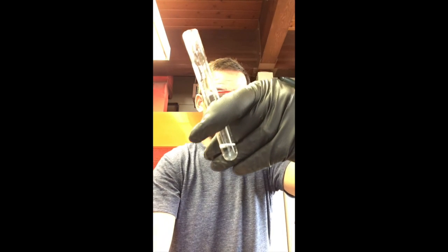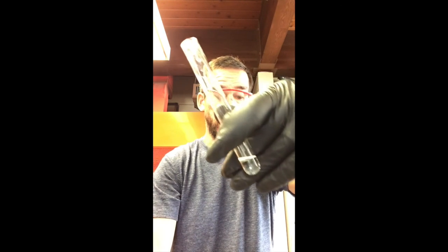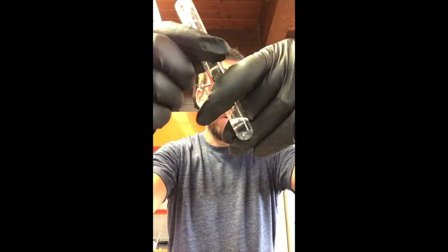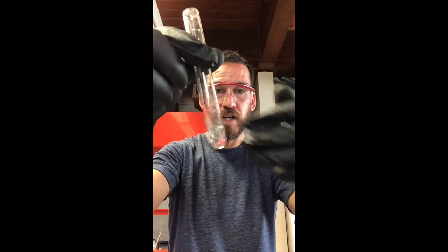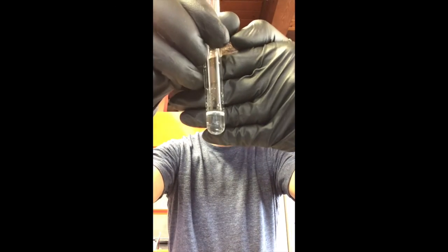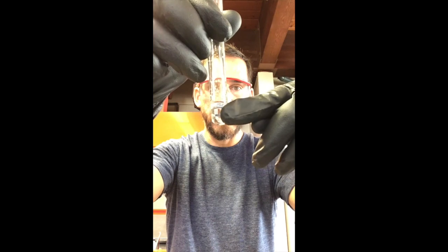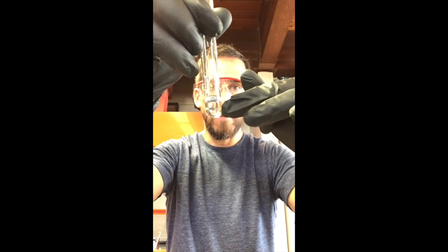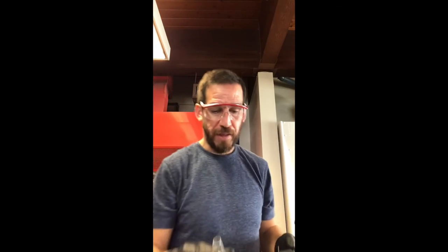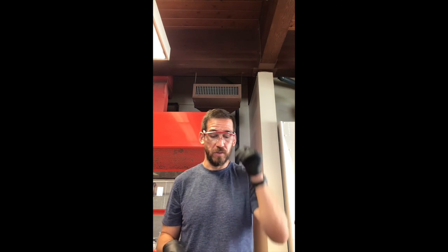Difficult to see, right? What I'm going to do is add a bunch. And you can see the layer on the bottom will get bigger. So after I give it a little shake, it's allowed to kind of break through and then fill up the bottom layer. Now it's a little bit higher at the top. Okay, well that was number 4 with unknown number 2. That's exactly what happened when we mix DI water with unknown number 2.